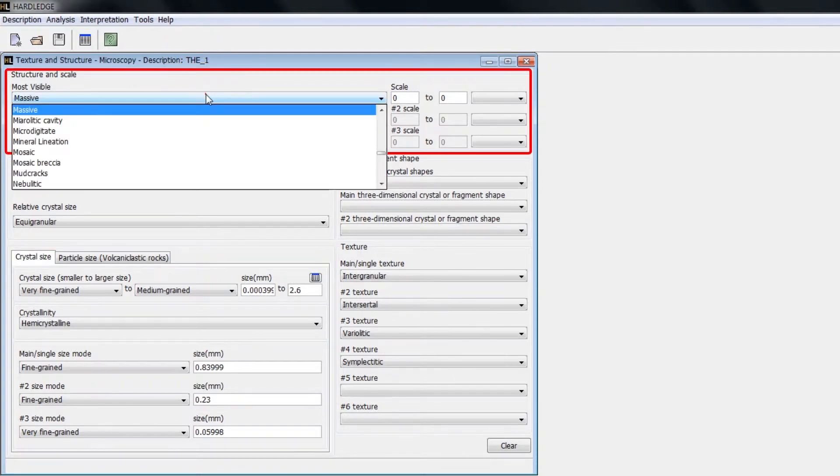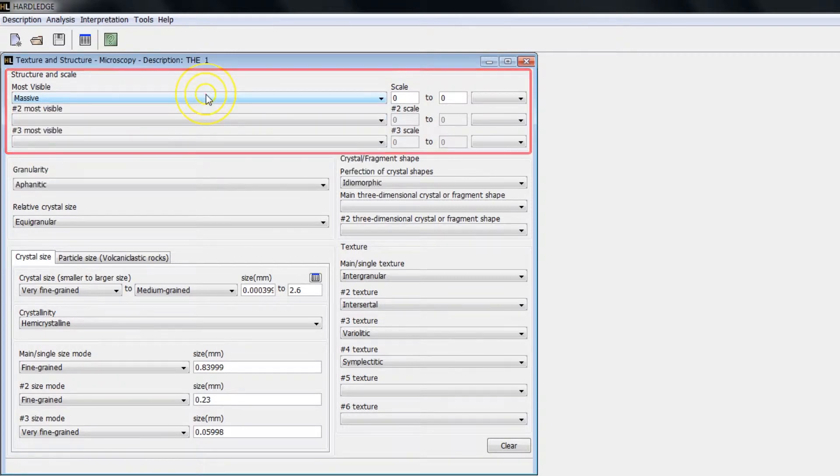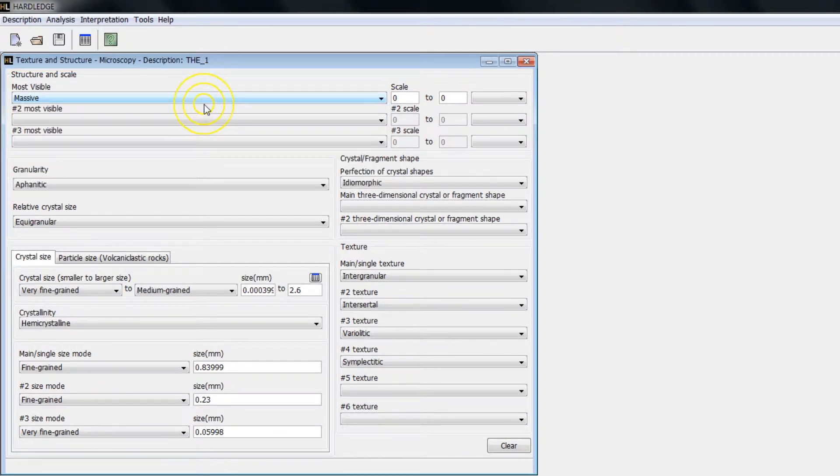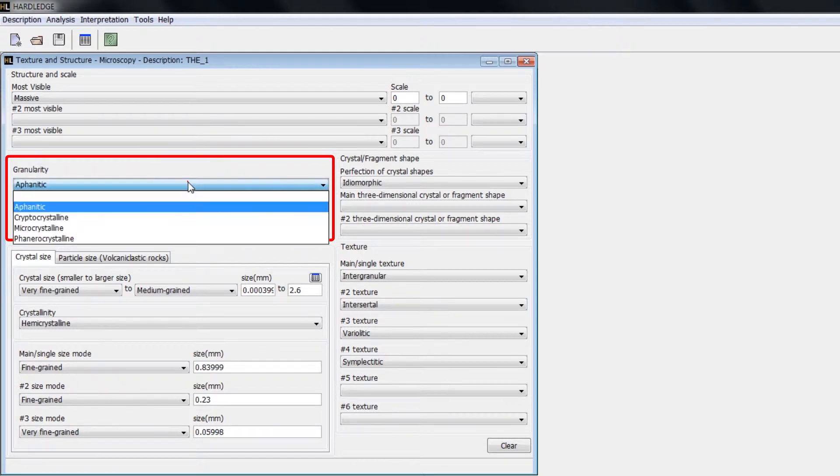For example, clicking on the list of structures, select a structure from the list and insert its dimensions. Clicking on Granularity, select the desired option.